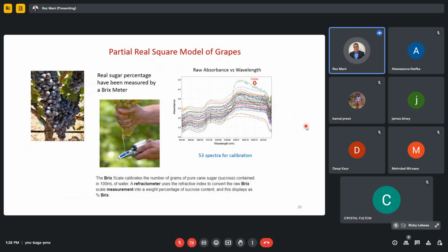Normally you want to remove the outliers just by visual inspection at the beginning. There are also other methods of removing outliers in statistical packages. Even Minitab has that. So we need to remove the outliers to have more accurate model.